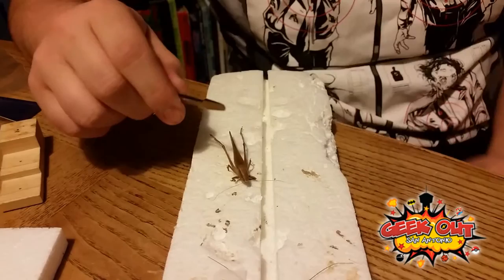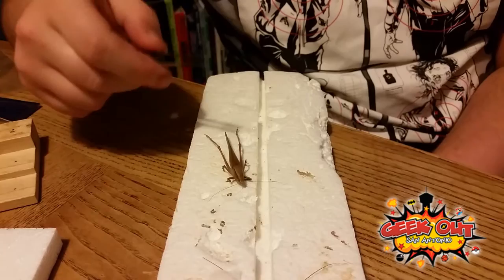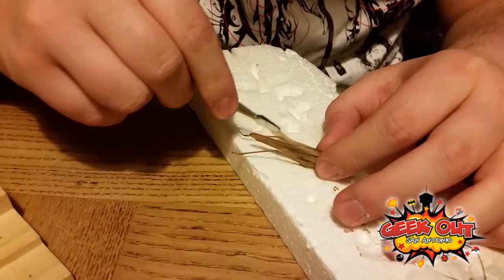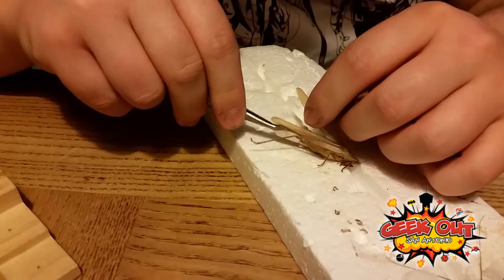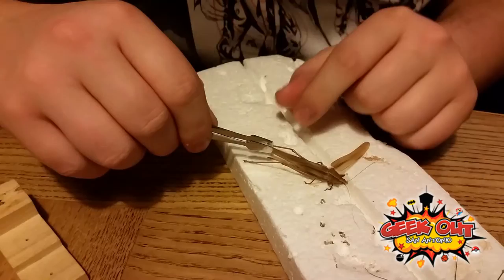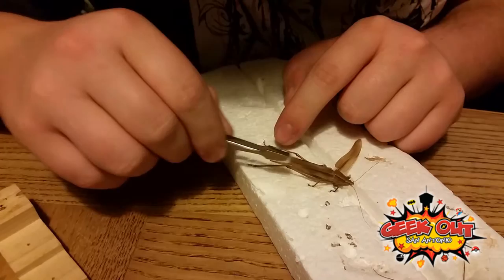Grasshoppers, katydids, and stuff like that are a lot more difficult to spread their wings because with a cockroach, all you have to do is pull it and it comes out. But with these, you have to find the little seam on the inside and kind of work with it to get it to come out. Most of the time I use my hands, but to actually get it, you have to take it and crack it. You have to actually pull it out and you can hear it cracking. It goes a different way and it stops trying to pull back. That'll make it easier for you.